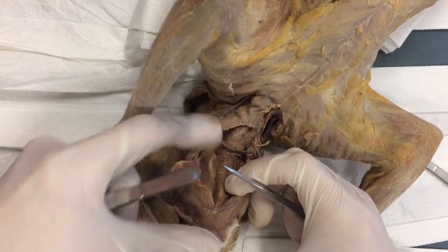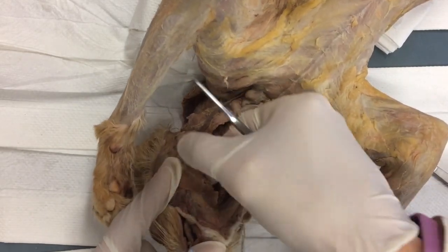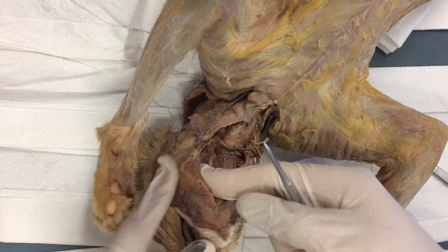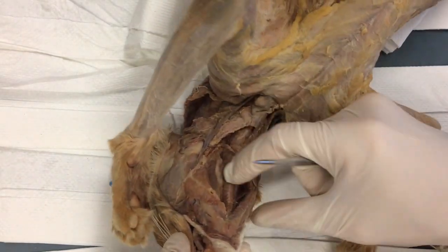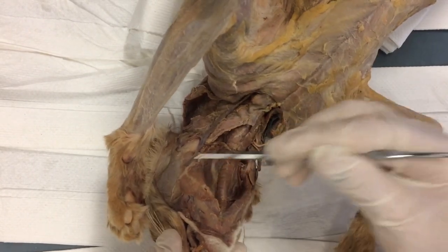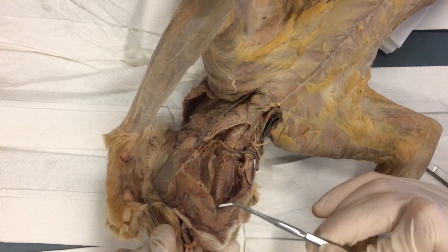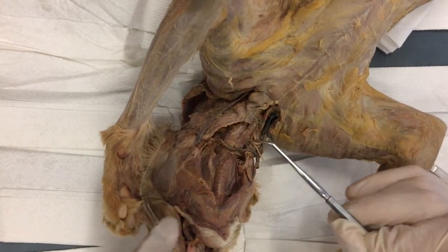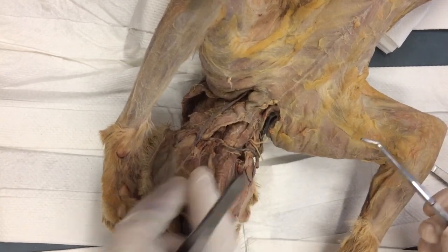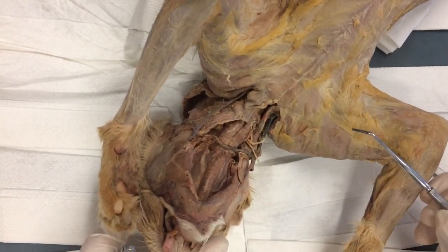We've done this technique before, and then to protect that flap, watch, I'm just going to press it down and stick it on the outside of that muscle. So I have 1/3 jammed up under here, the other 2/3 there. The difficult part is trying to be clean through here. You can see that's I'm gonna say that's about a 92%. That's not bad, except for that hole I put in there. And that is the mylohyoid, the hardest muscle you're going to dissect.